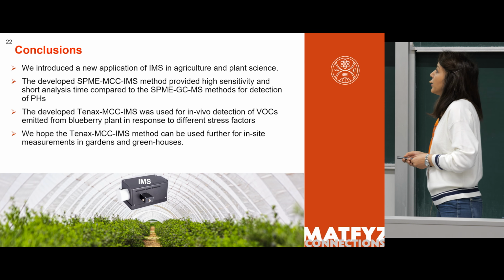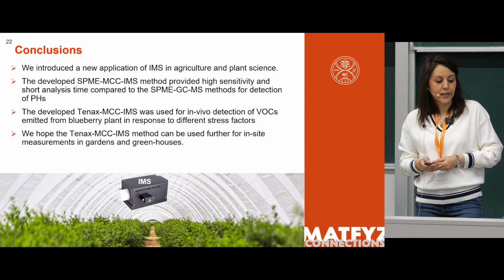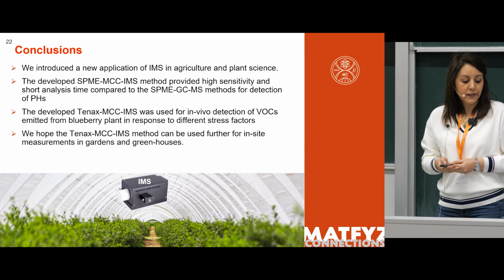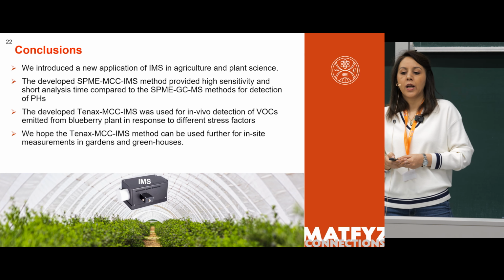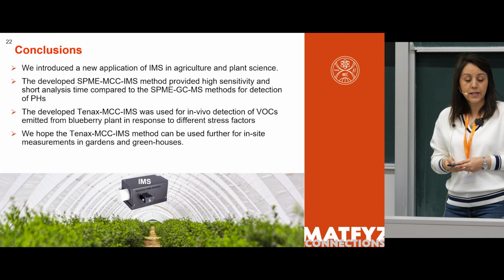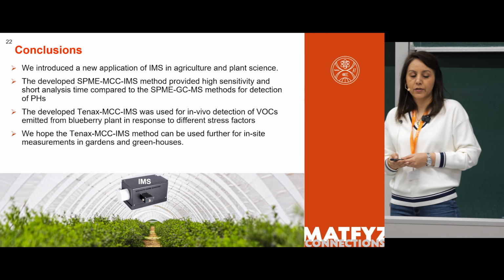In conclusion, we introduced a new application of IMS in the agriculture field, and we developed the SPME-MCC-IMS method as a sensitive and fast method for detection of plant hormones. We developed Tenax-MCC-IMS for in vivo detection of VOCs emitted from plants. In vivo means collecting of VOCs from living plants. And we hope the Tenax-MCC-IMS method can be used further for in-situ measurement in gardens and greenhouses.